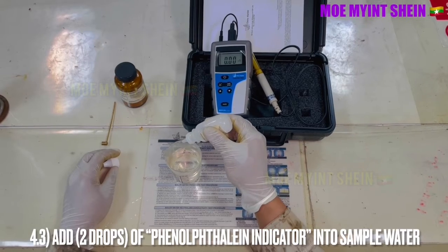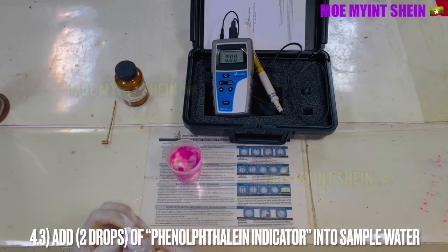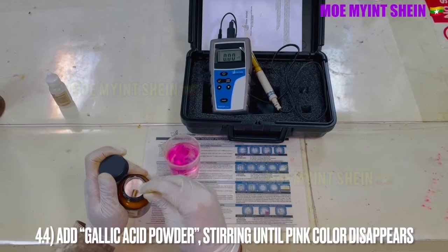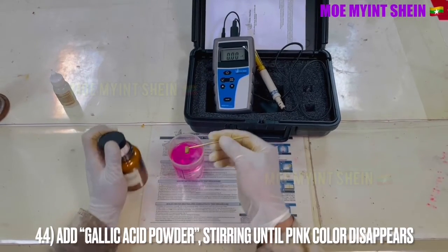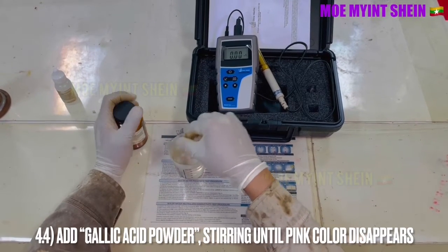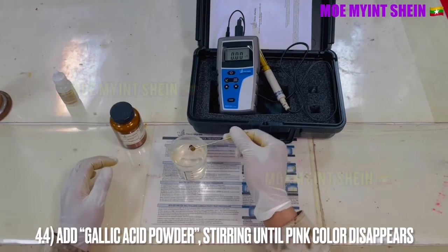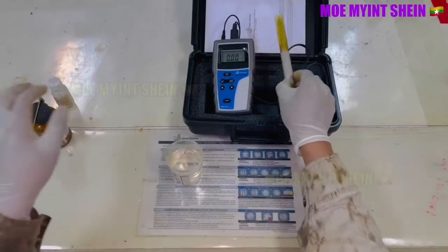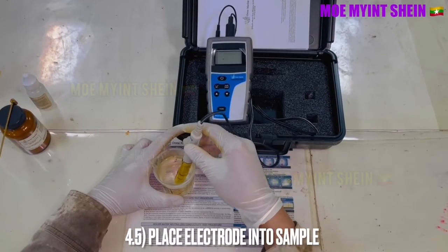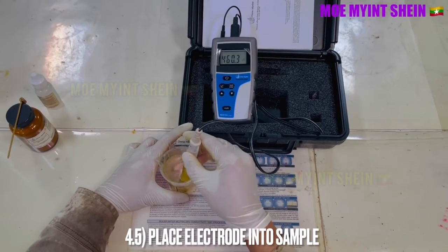Then add two drops of phenolphthalein indicator into the beaker. Add oxalic acid powder into the sample water and stir until the pink color disappears. After that, place the electrode into the sample water. Stir the electrode gently and allow time for the reading to stabilize.